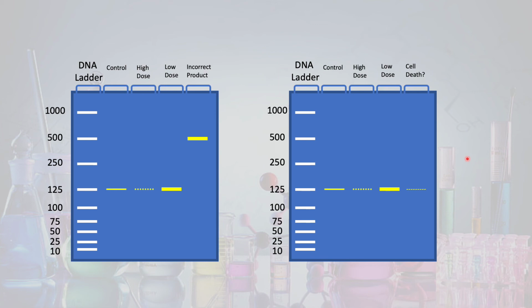So the idea behind choosing a housekeeping gene is that the transcript, the mRNA transcript quantity for our housekeeping gene typically doesn't go up or down very much. It's supposed to be a relatively steady state gene so that insults like these toxins don't change it very much. If the total transcription of our housekeeping gene is changing, it can reflect essentially the health of the cell, right?